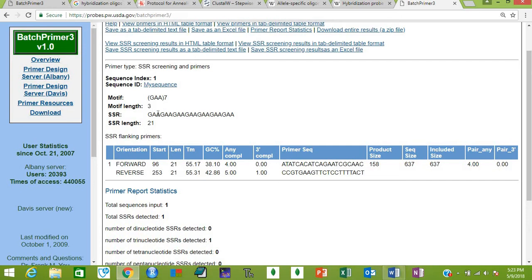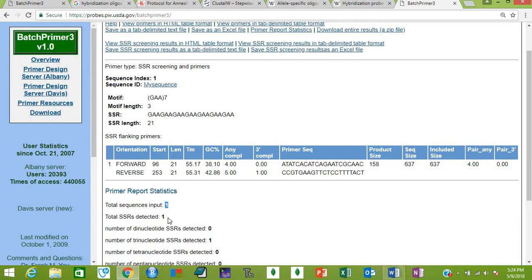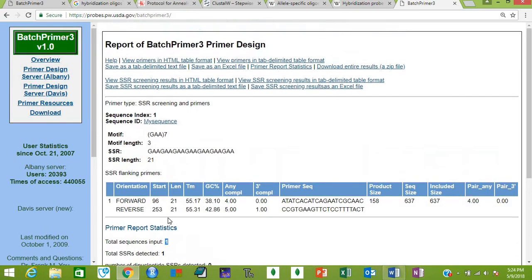This is the result. This is the SSR that it has screened and found. It says that only one sequence has been found and only one SSR has been detected. We had input only one sequence, so it says one sequence was the input and one SSR was found in that sequence. These are the two primers that will flank your SSR.